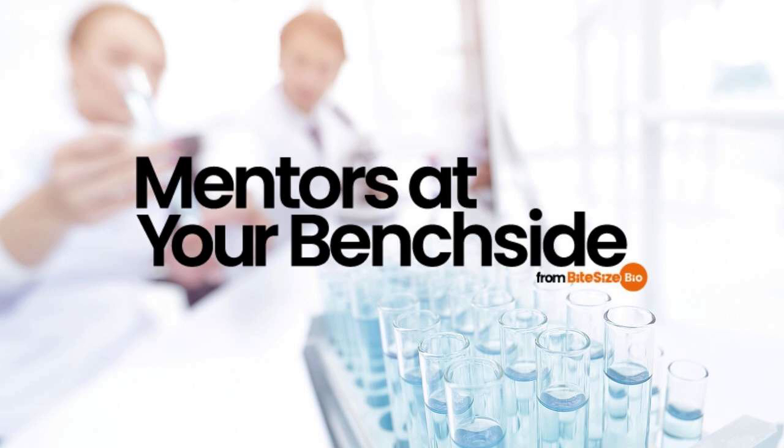A common mistake is to say that paraformaldehyde is used to fix cells. In reality, paraformaldehyde is an insoluble white powder that won't fix anything. The solution we use is methanol-free formaldehyde. For fixation purposes, it should be diluted with phosphate buffered saline to a concentration of anywhere between 0.5 and 4%.